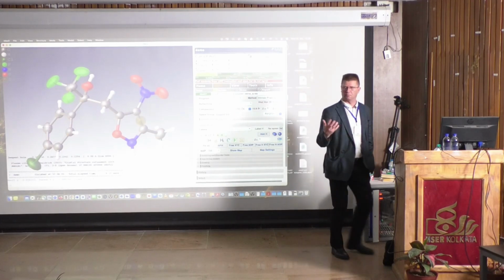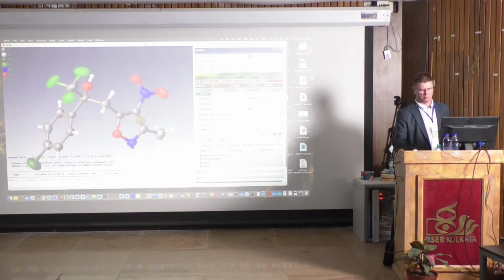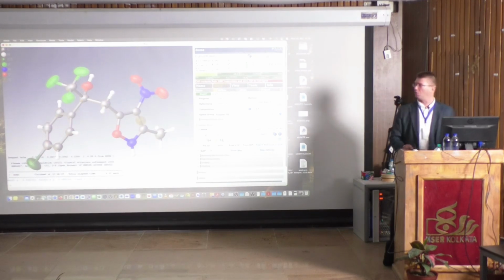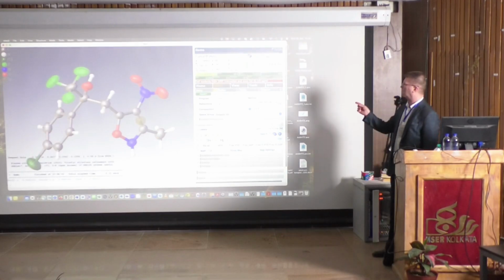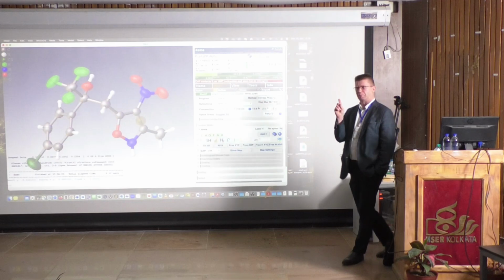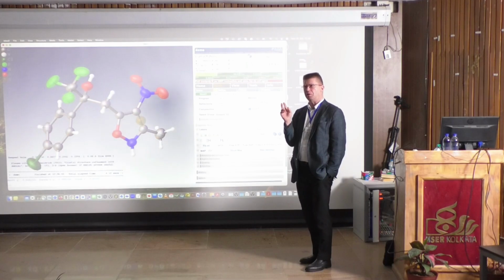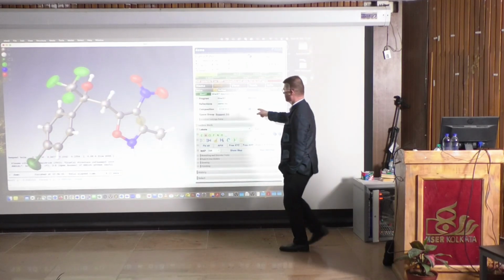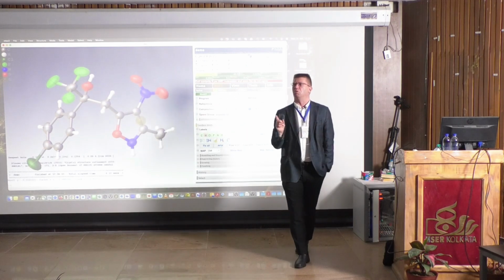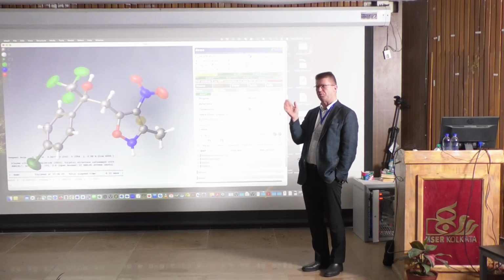So this can happen. We find some additional atoms, and we know, okay, they are fine, but it's not taken into account, so that's the reason. You can see that it says the cell contents and the unit instructions list, meaning that they don't agree. So we will now look carefully, because there are two possibilities. Either my contents from the beginning were incorrect, or I have incorrect atoms in here. And now this requires a quiet moment.